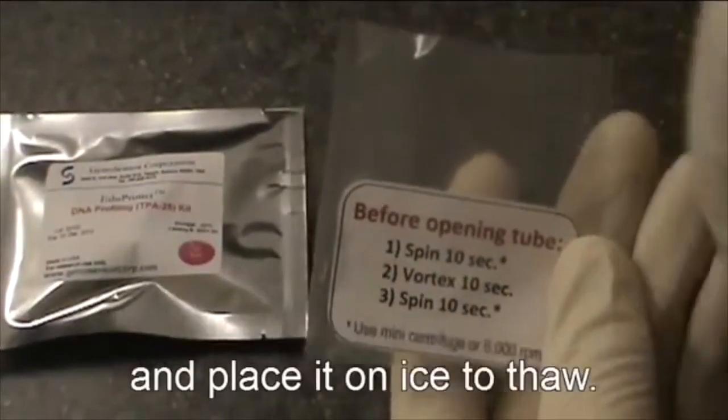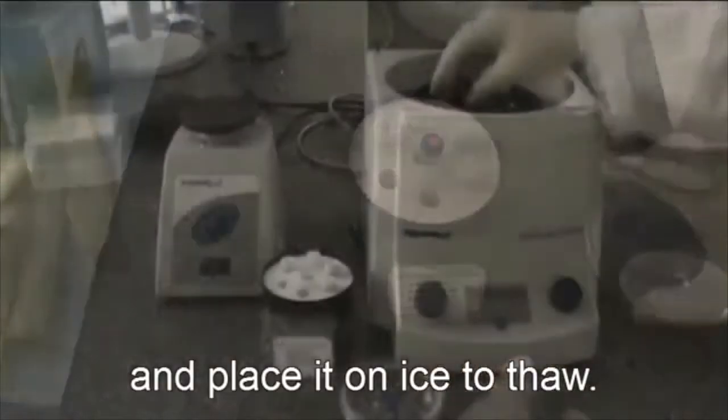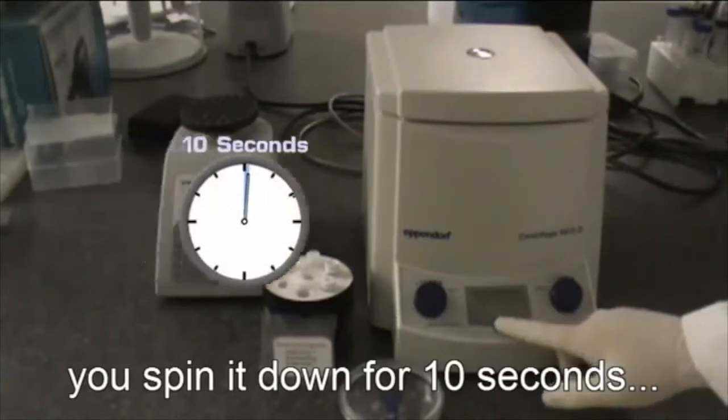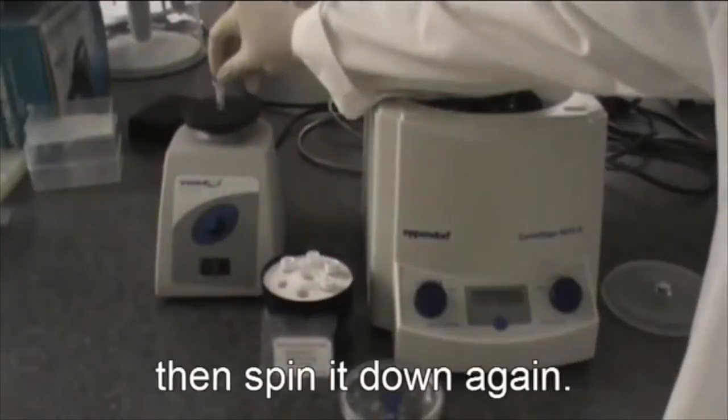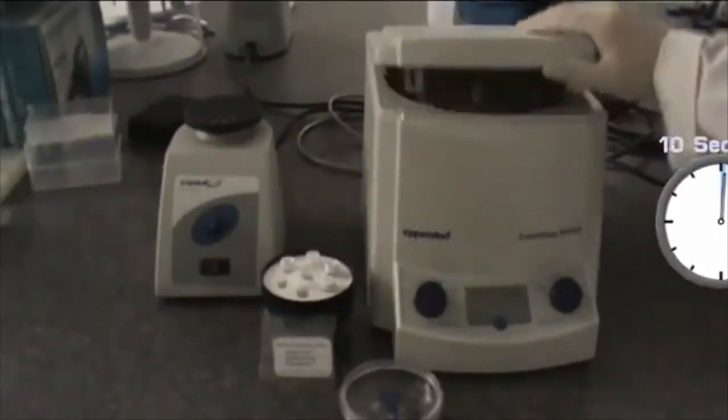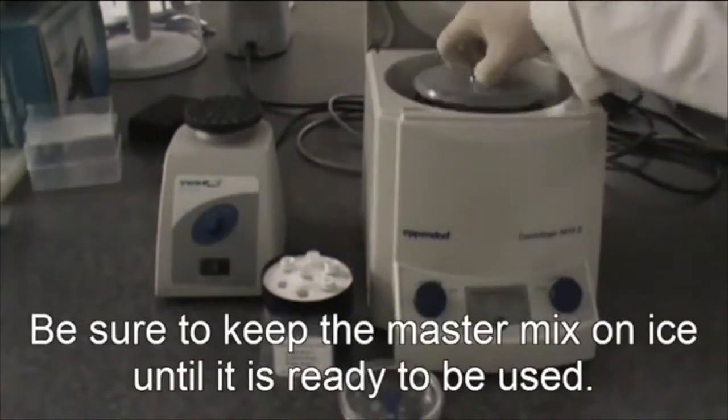Remove the PCR master mix from the aluminum bag and place it on ice to thaw. Once it is thawed, it is vital that before opening the tube, you spin it down for 10 seconds, vortex it, and then spin it down again. Be sure to keep the master mix on ice until it is ready to be used.